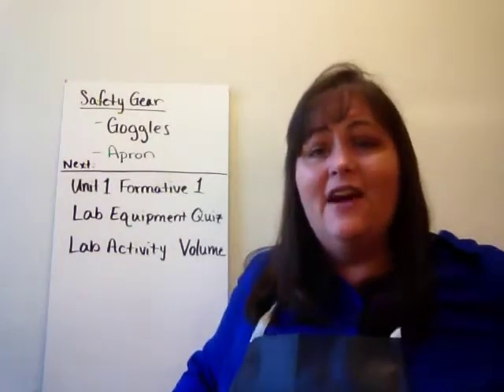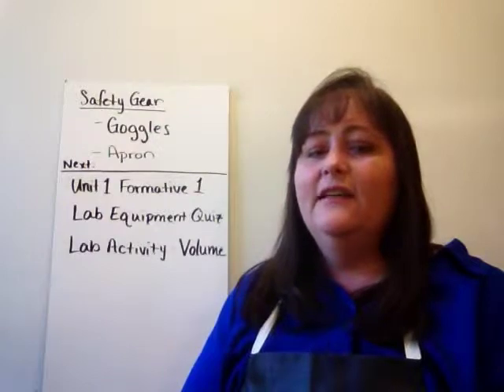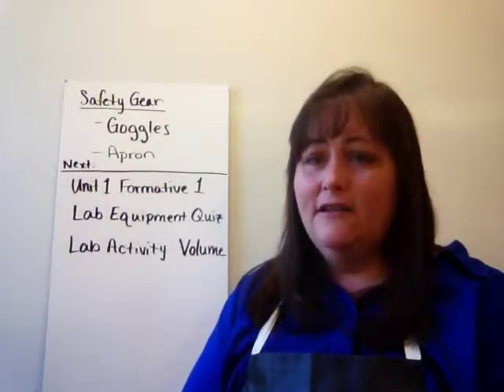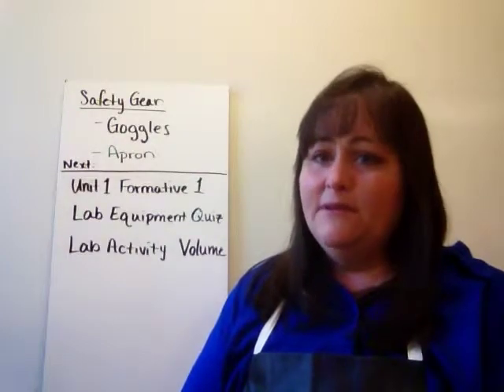You don't need to tie a knot. They wrap around and you tie these little strings together. Be very careful to tie it loosely because if you tie it too tightly, it will be hard to get off. Now, that's your lesson in lab equipment.